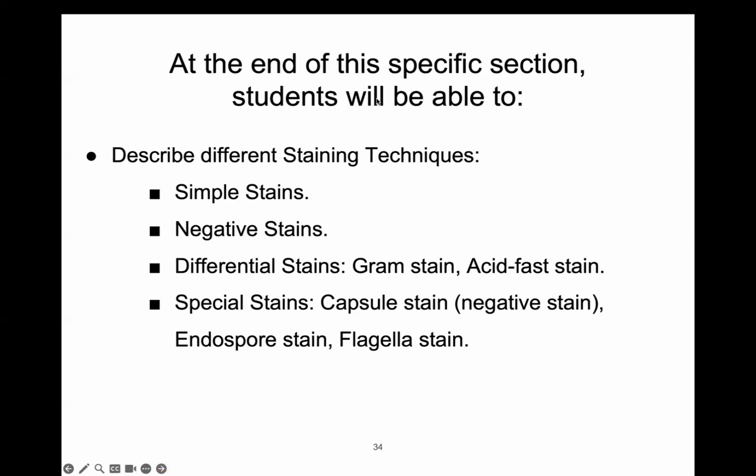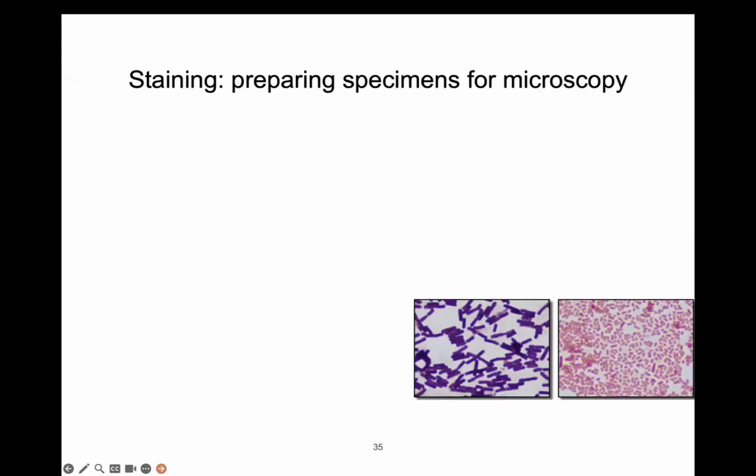So by the end of this specific section, you'll be able to have an understanding of staining, simple stains, negative stains, differential stains, and special stains.